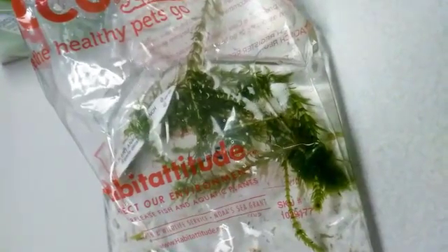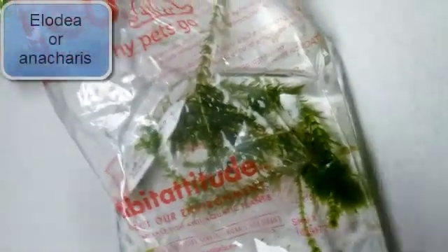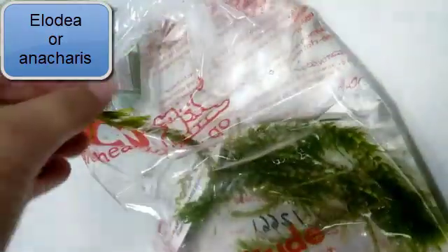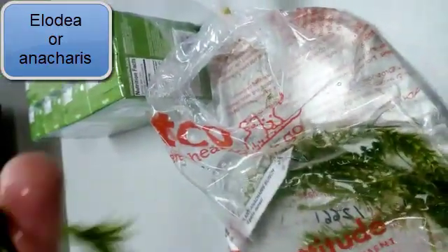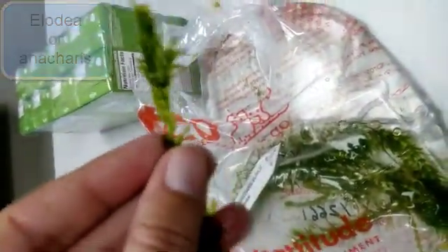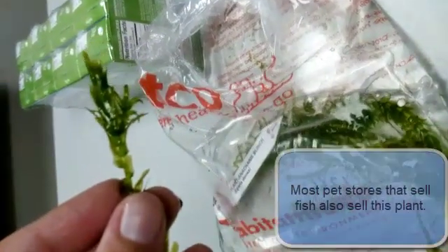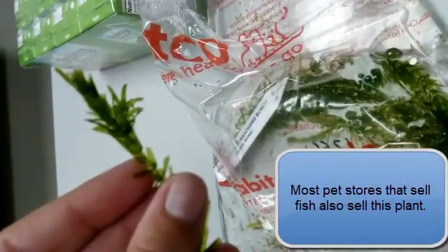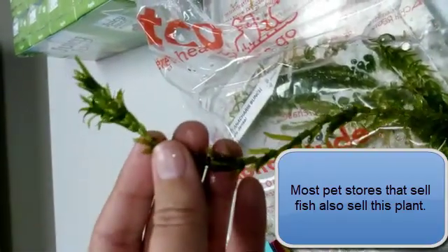So what you're looking at here is a common aquarium plant called anacharis. This is what we're going to be looking at under the microscope. It has kind of a feathery, leaf-type structure.